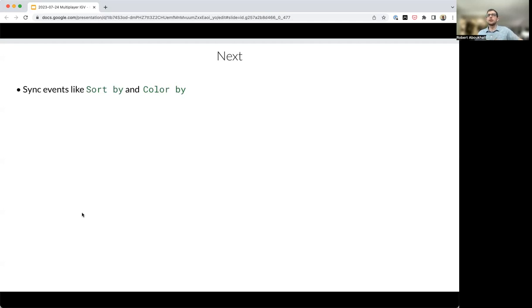So that's something I'd like to do, work with the IGV.js team to support that. The other thing is, can we integrate the same logic with other genomics visualization tools? I've tried writing that in such a way that it can be extracted into a library that's not very dependent on IGV.js itself. And so it would be really exciting to see if we can supercharge other tools to do the same thing.